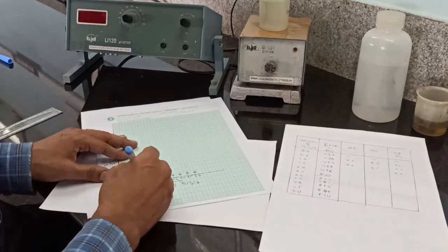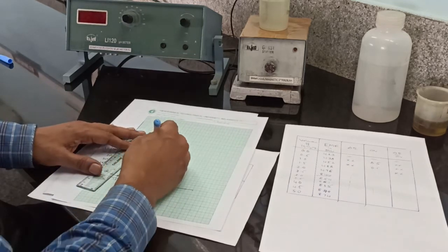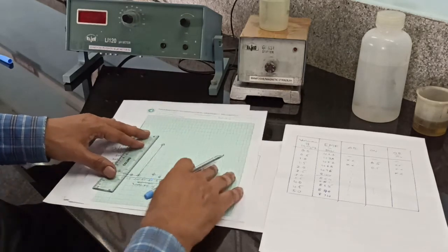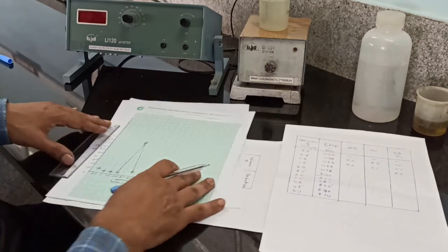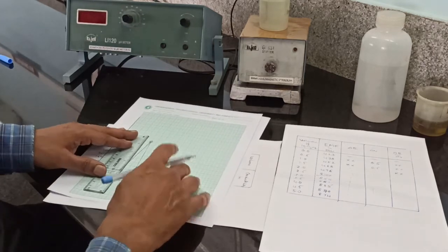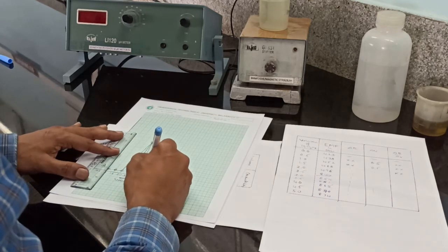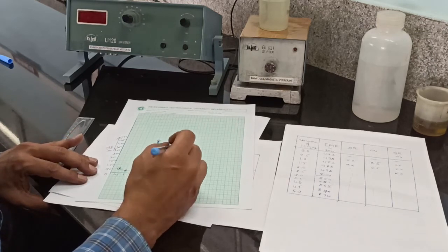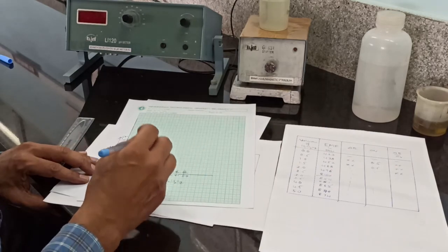Now connect these points by free hand, then use a scale to connect these 2 points with a straight line, and one more straight line to connect these 2 points. Again connect these points by free hand. Now the volume corresponding to the maximum gives the equivalence point. So this equivalence point is used to calculate the strength of FAS solution. Then you have to calculate the amount of FAS present in the given solution.